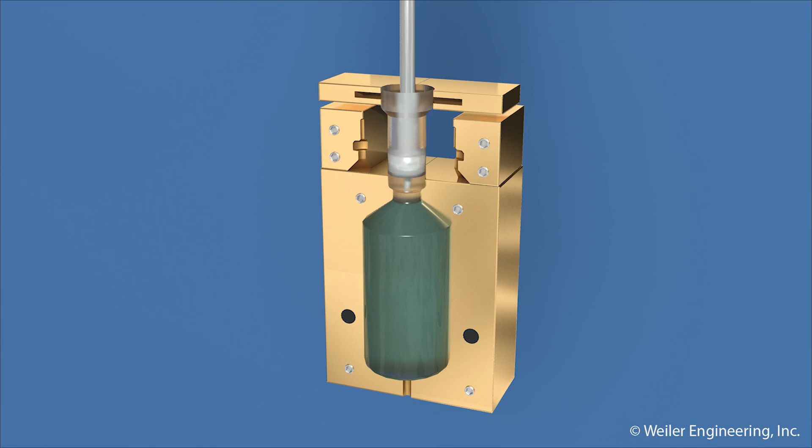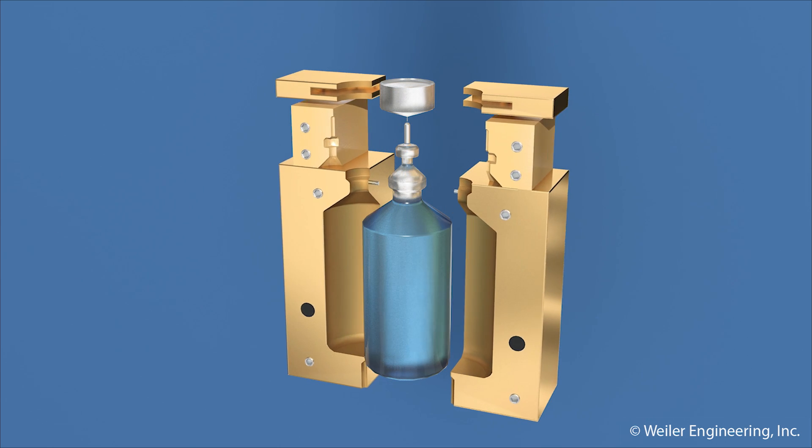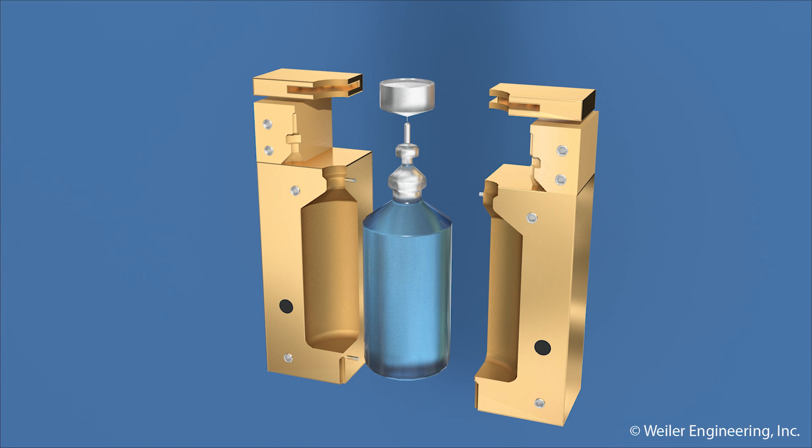Separate sealing molds close to form the top and hermetically seal the container. The mold opens and the formed, filled and sealed container is conveyed out of the machine.